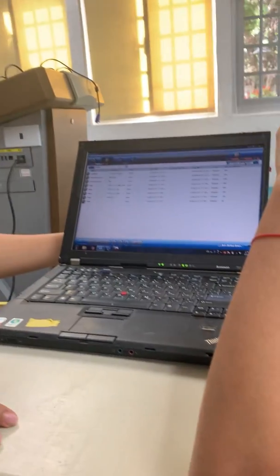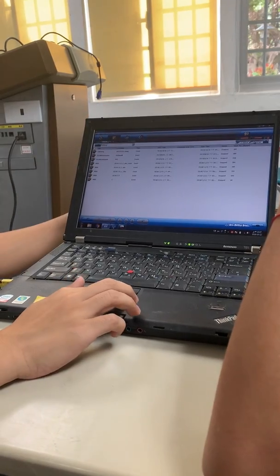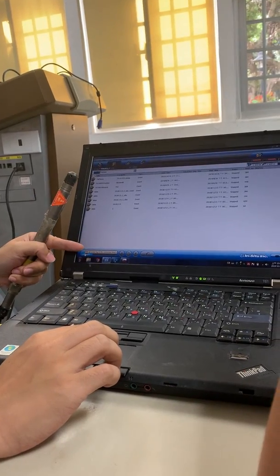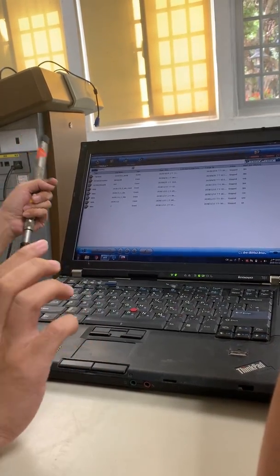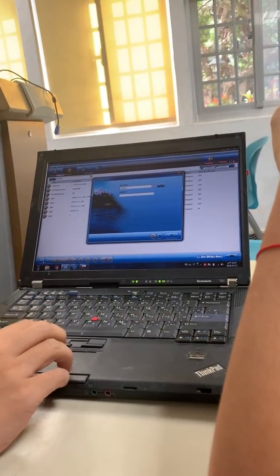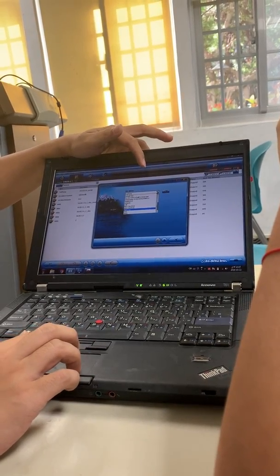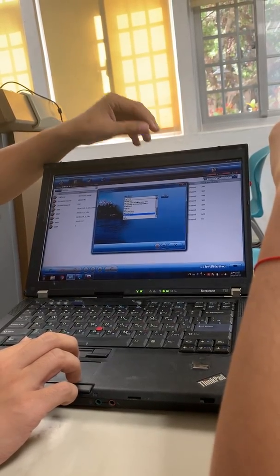Now we start to make a record. First, click here to set a new log in the bar. The first field is the site name — you can select from the dropdown. The site name determines which folder your output data will be placed in when you export it.